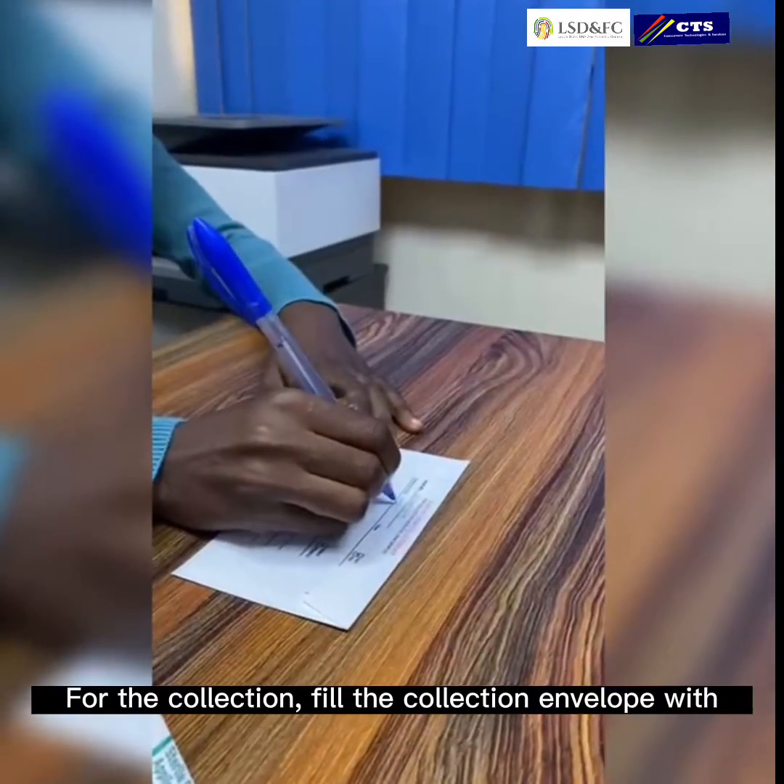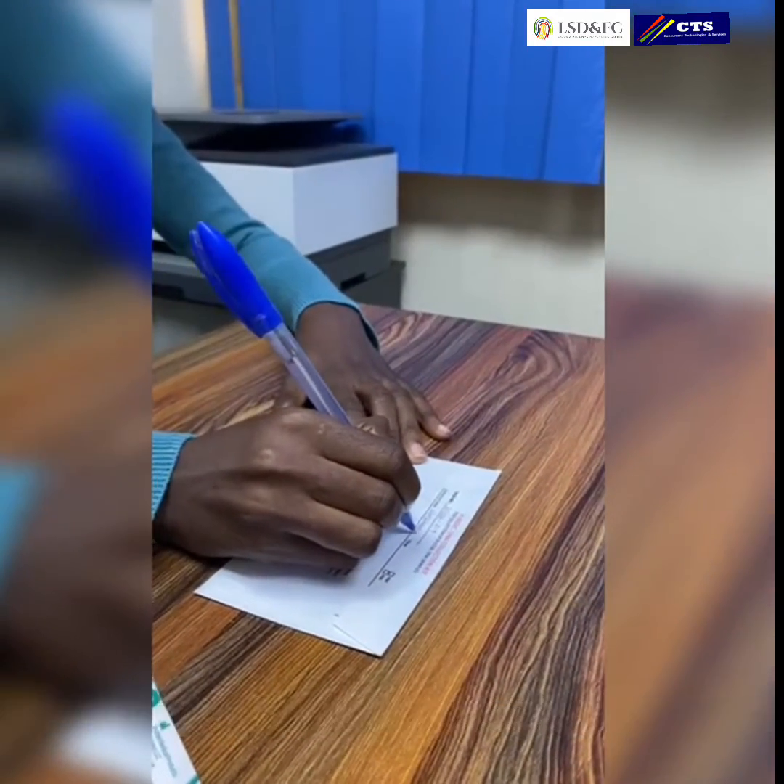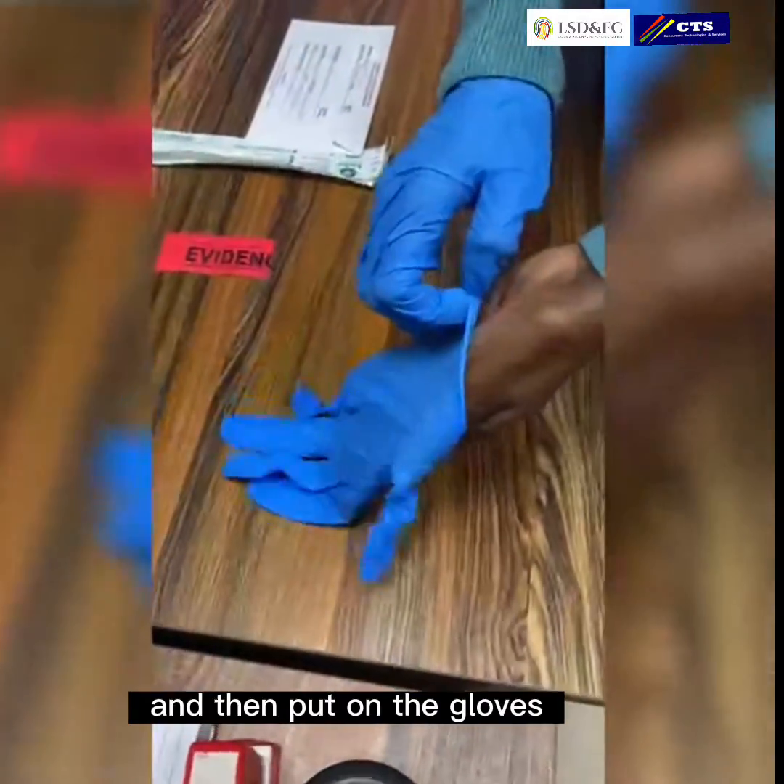For the collection, fill the collection envelope with the correct details of the individual to be tested and then put on the gloves.